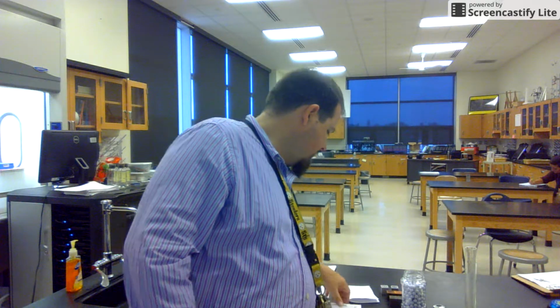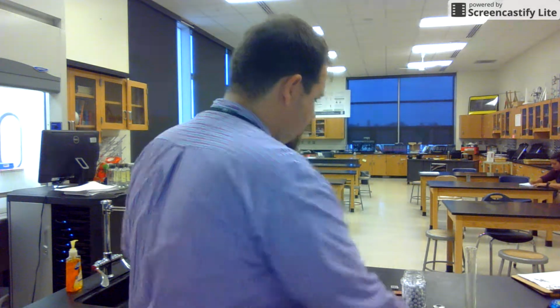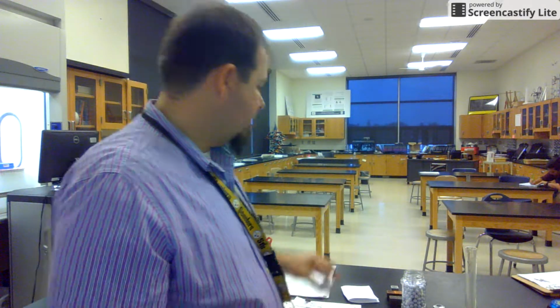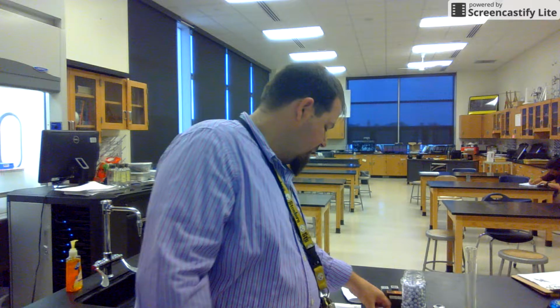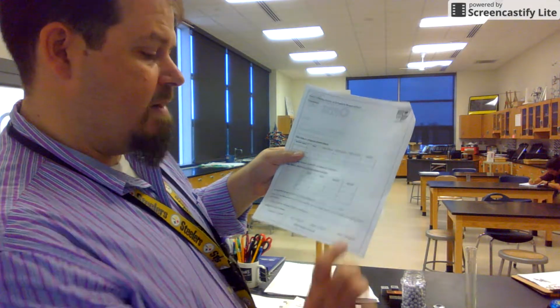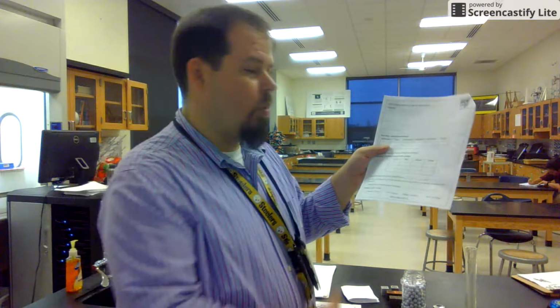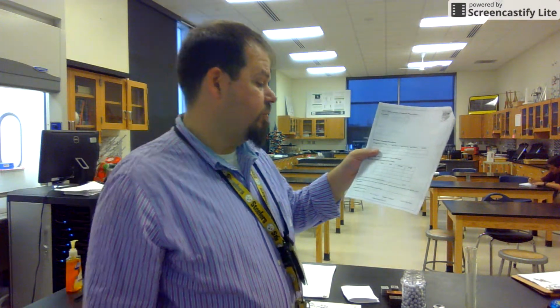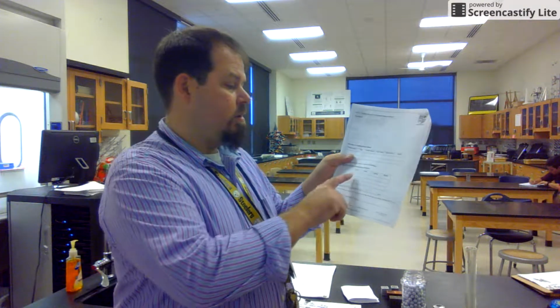What I'm interested in is you using your ruler to find volume, use the balance to get mass, do the ratio of those two things to come up with density. I have included densities of three metals. One of your answers is going to probably be there.